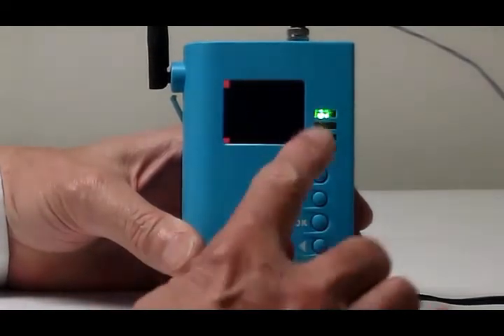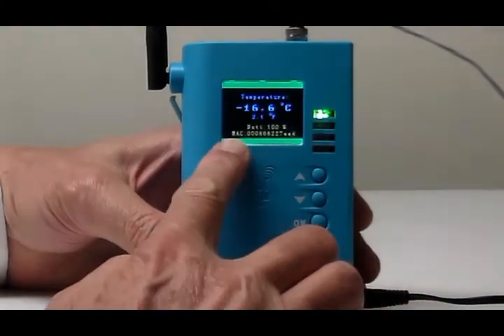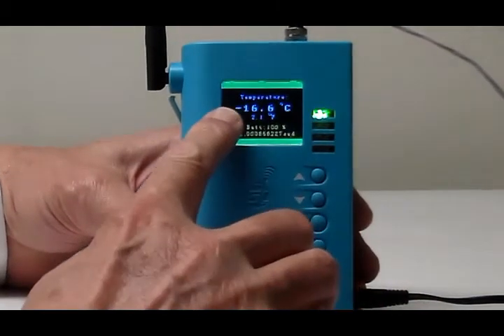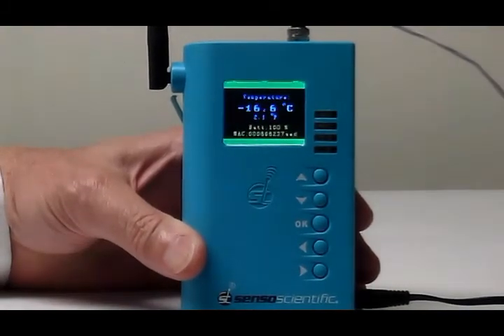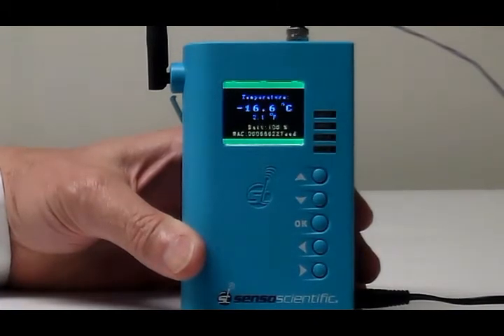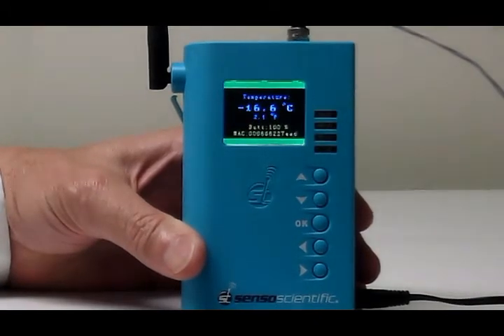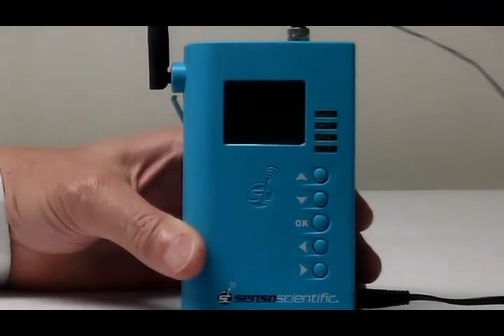And then the top light is flashing green and the screen goes green and it shows you the reading of the temperature. This unit's actually installed in a freezer and you can see the temperature is minus 16.6 degrees C. So that's all there is to it. Shortly that will go off and the unit will go back to sleep. So it's now working.